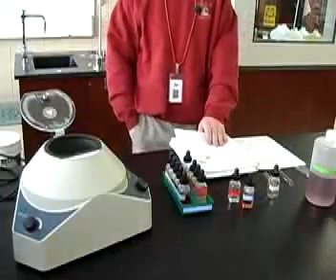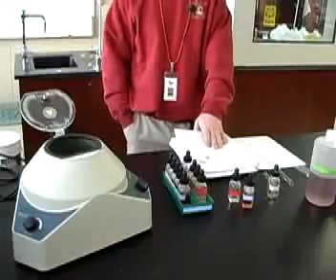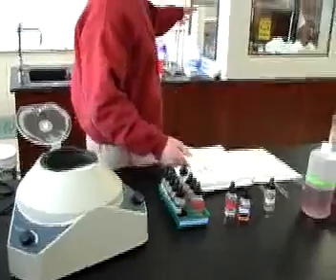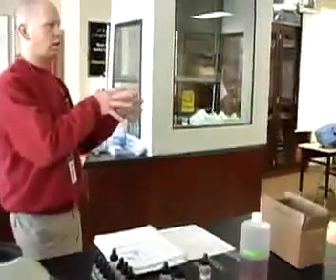Disposal of the solutions. Many of the solutions and ions being tested are poisonous, and so in the fume hood over here we'll have a really large container that says waste solution, so don't dump any of that stuff down the drain, just go over to the fume hood and dump everything in there.